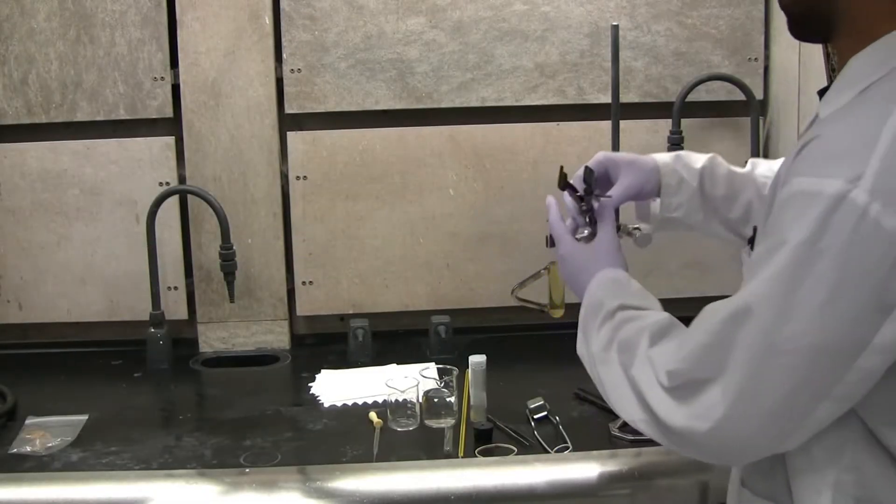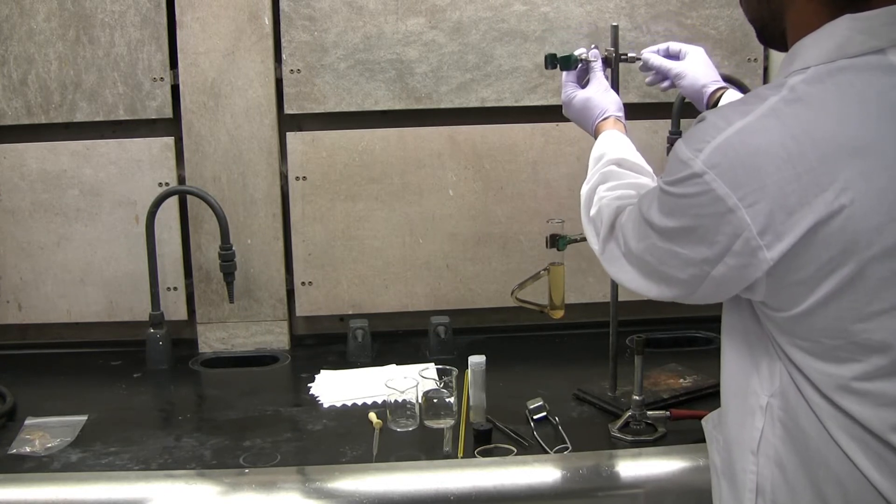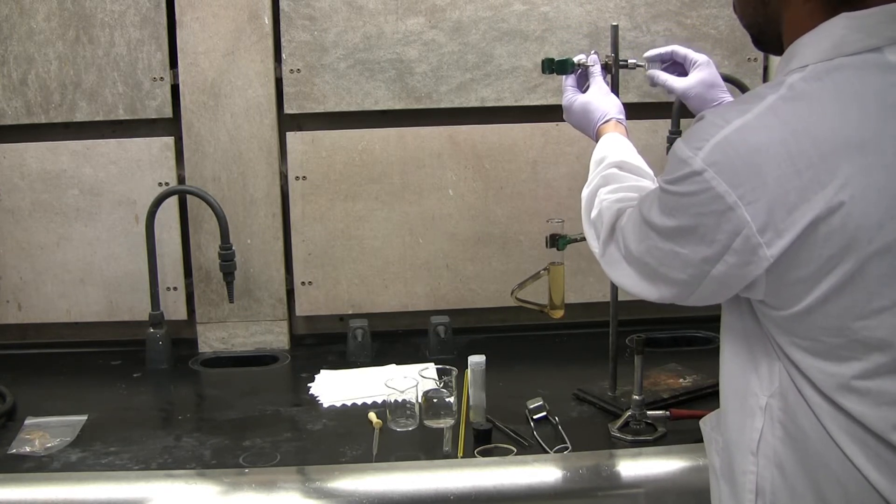First, start by assembling the clamp onto the retort stand. Make sure it is fastened tightly and securely.